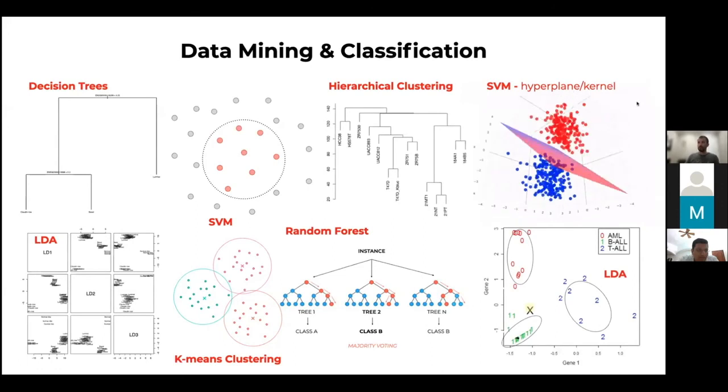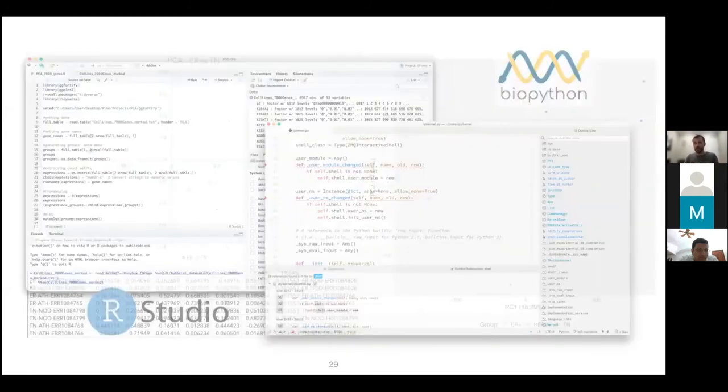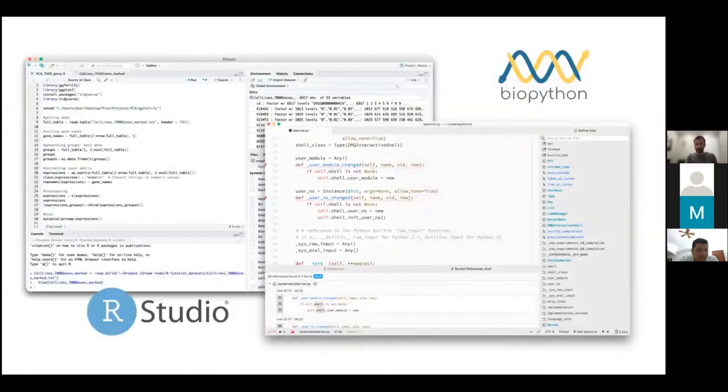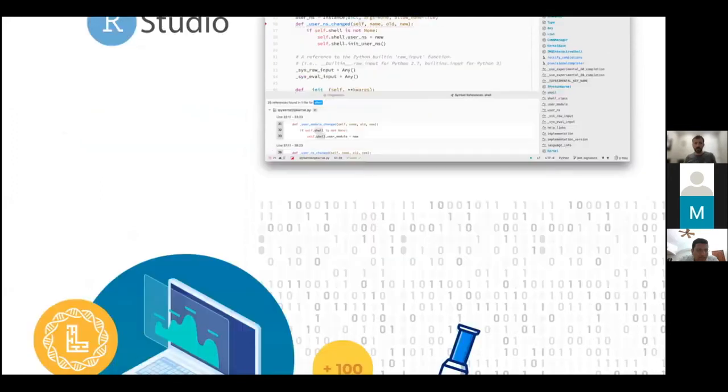Then we will talk about how this applies to specific biological examples, like the ones I mentioned in the beginning. In cancer, we have different subtypes of cancer. How do we understand their differences, and how can we ask questions about those differences? And then we'll introduce you to some coding exercises where we will explain how to load this data, visualize this data, and also how to perform some similar analysis steps using coding. That coding will be done using our OmicsLogic coding playground. So let's take an example of one of those exercises.